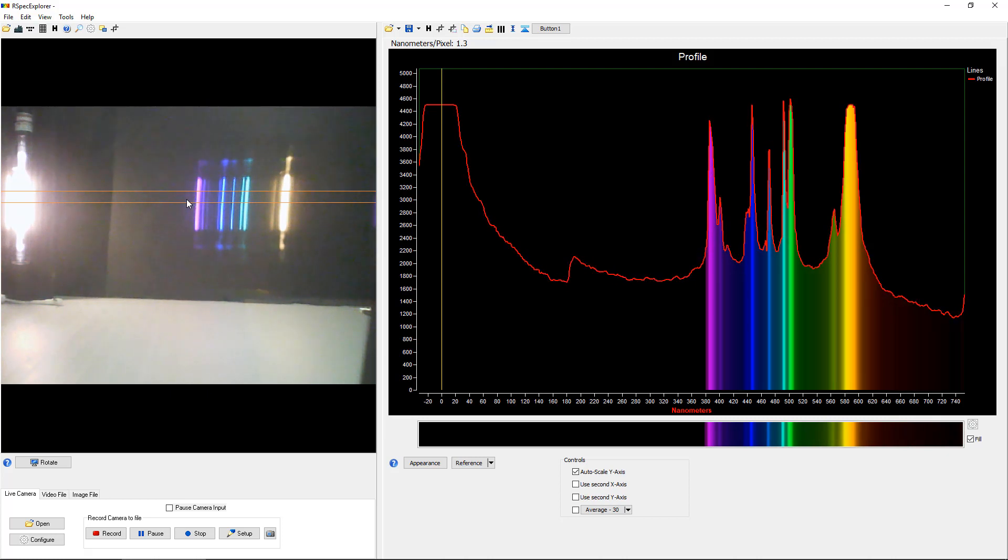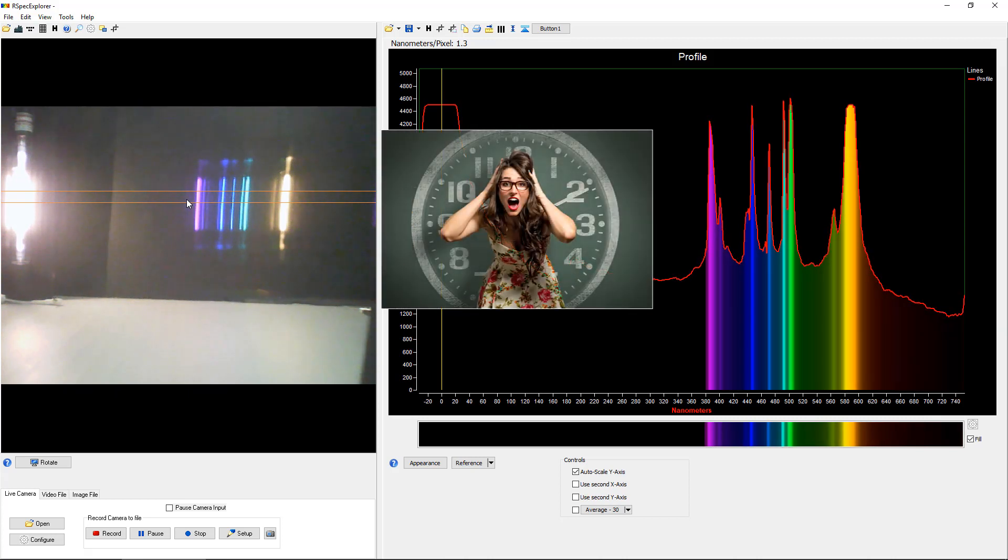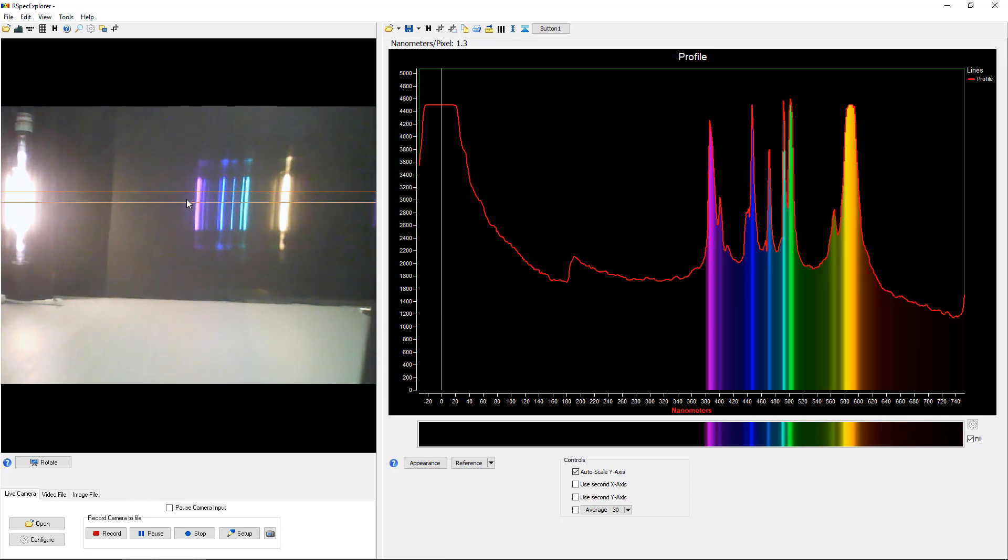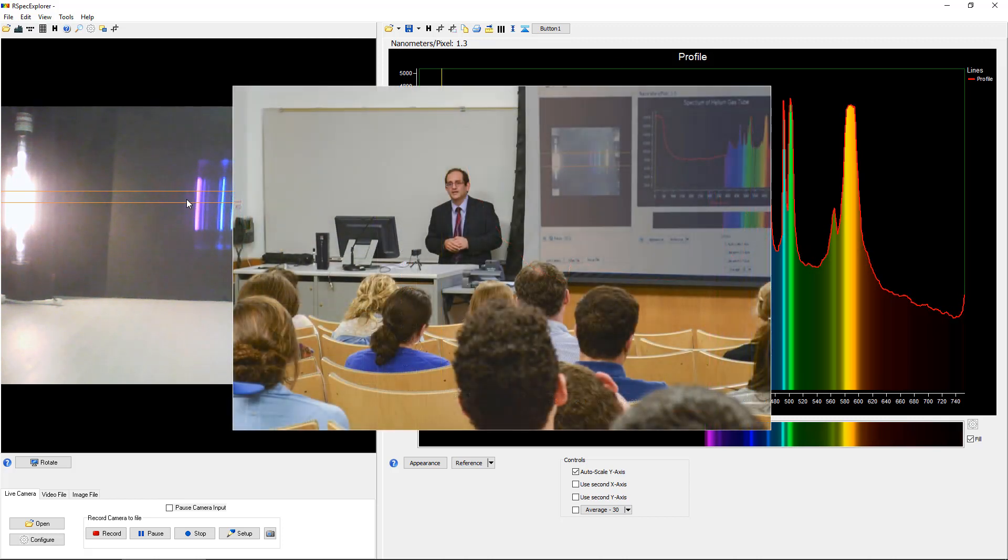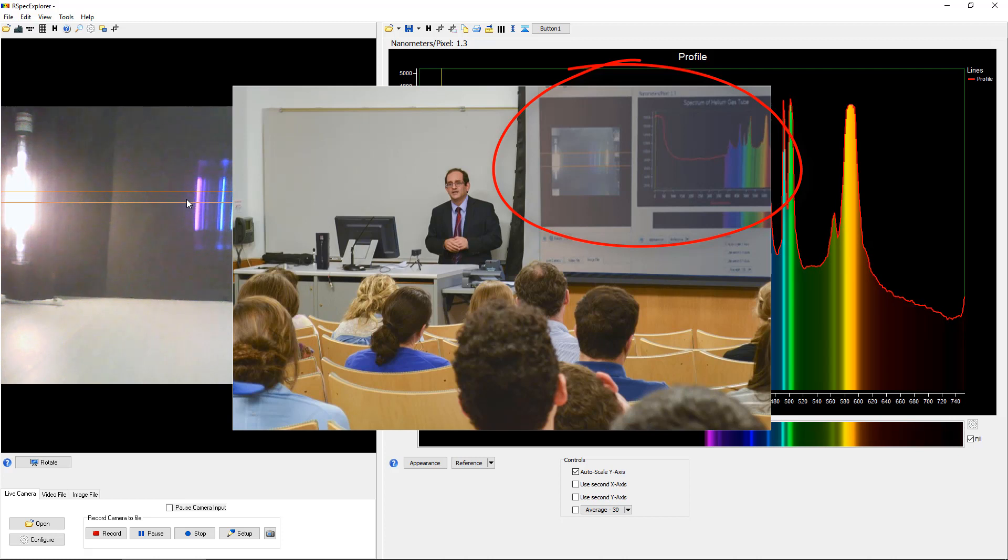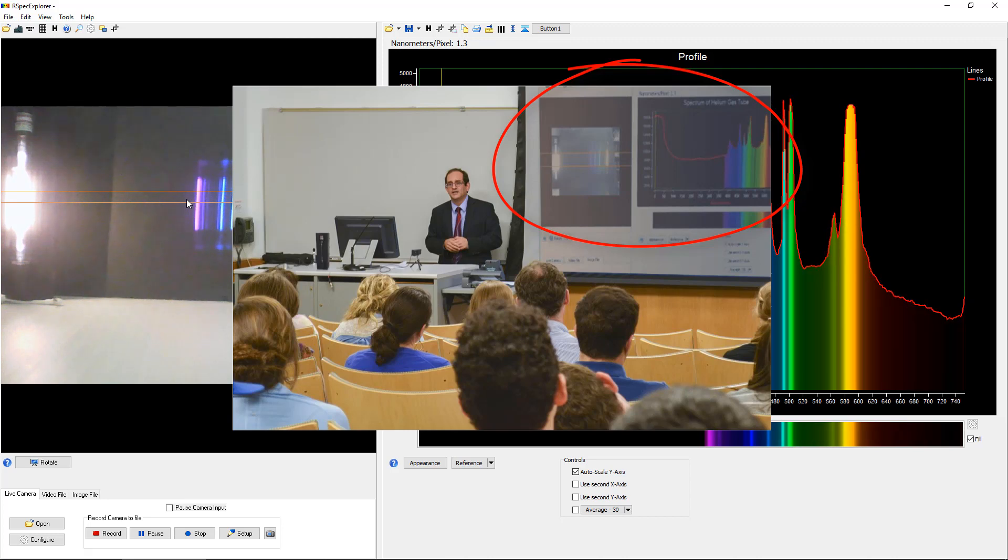In fact, we were at a conference recently and a teacher said to us, where were you last month? I spent 20 or 25 minutes of my class just trying to get everybody to see what you're showing here in just a few seconds. With RSpec Explorer projected on your classroom screen like we're seeing here, everyone sees the same thing at the same time. There is no dependence on finicky and hard to use handheld spectrometers. And best of all, spectroscopy is no longer a private viewing experience. You and your students share the same view and can even take measurements together directly from the screen.